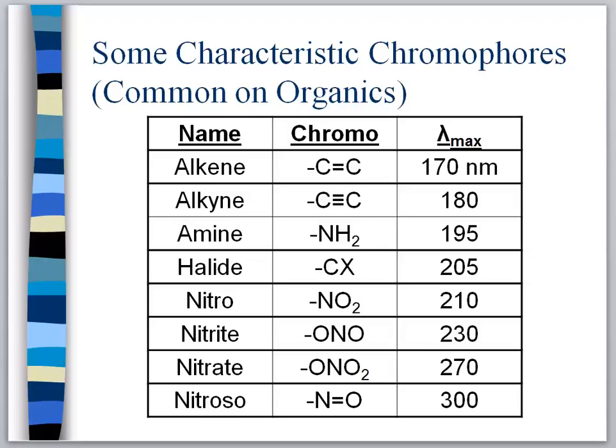And the easy part is that, as a lab analyst, if you're working in a laboratory, you probably don't need to memorize all of that mess. Honestly, the only thing that I memorize is that if it's a non-colored solution, I probably need to be scanning 200 to 400. And if it's a colored solution, I probably need to be analyzing from 400 to 800 or 400 to 900. That's all that I have to remember working in a laboratory. The machine will do the rest, and the instrument will do the rest.